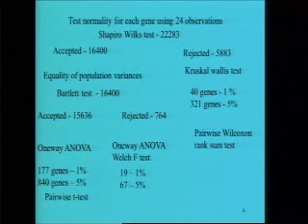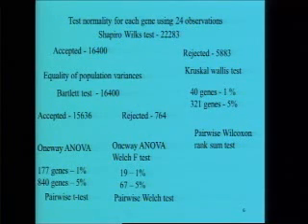Similarly, for one-way ANOVA we apply the pairwise t-test for these three contrasts that we have to test. For the one-way ANOVA Welch test procedure, we apply the corresponding pairwise Welch test. So these pairwise tests again tell us that the gene has a different profile in which group. Okay.